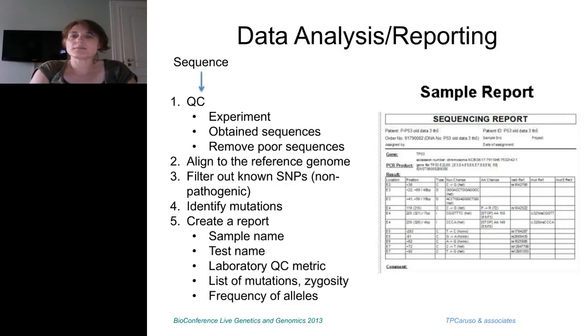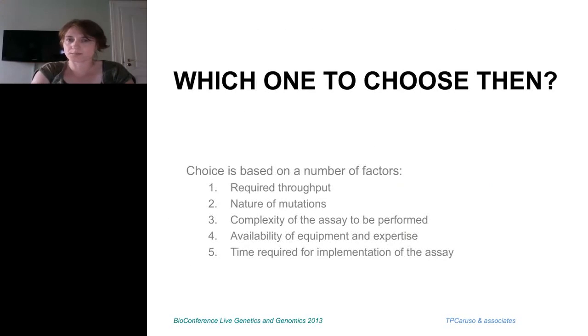And basically the building of this report will be very much dependent on each lab that has their own preferences. They want to do their own thing, and they have to interact with the bioinformatics team to make sure that everything they need is captured in that report.